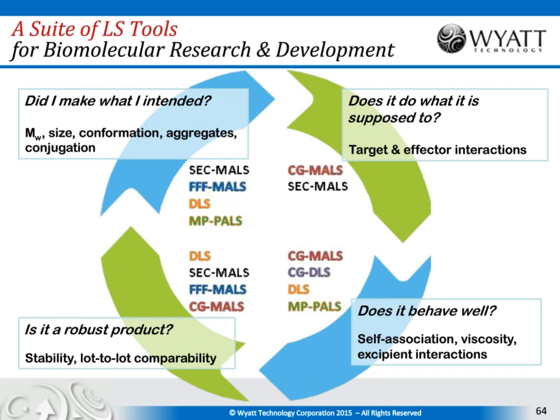Oh, okay. So yes, it does. If you have fluorescence, what will happen is you'll have a background signal. So remember that in DLS we're looking at the fluctuations in scattering signal, and so the fluorescence is usually not a fluctuating signal. It's usually fairly uniform in time, but it is a high background, and so it decreases your signal to noise, makes it more difficult to measure.